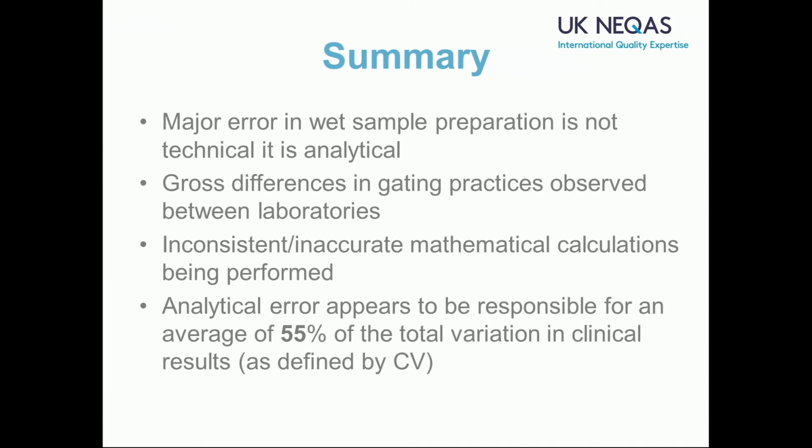We're going to carry on doing electronic trials. We do think they're beneficial, so we're going to issue them as educational trials in addition to the work that you are already doing. We're going to do a few more CD34s, and some more MRD ALLs. With Steve's help, we're going to do a PNH, and hopefully a plasma cell, as we were just talking about.